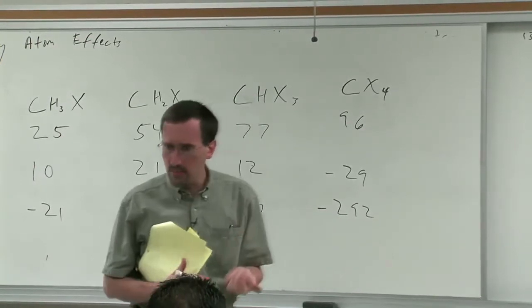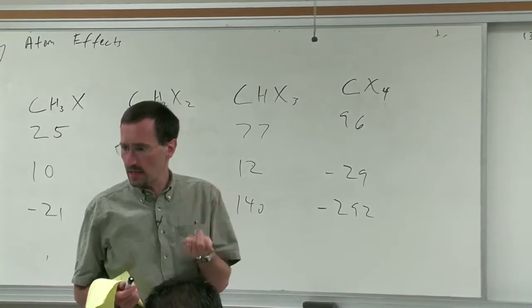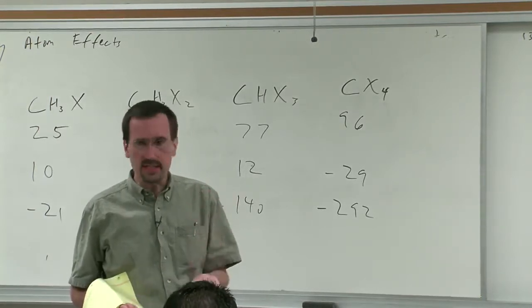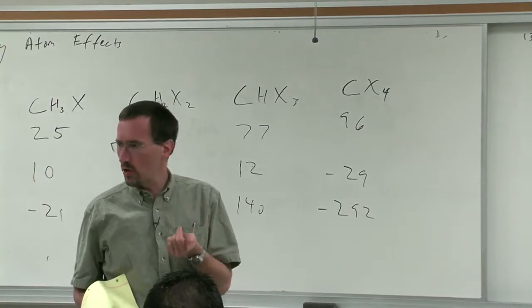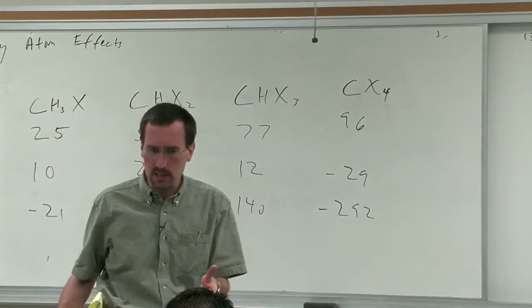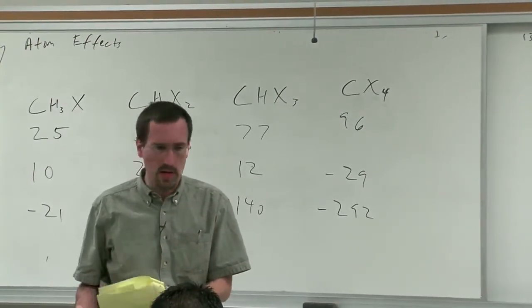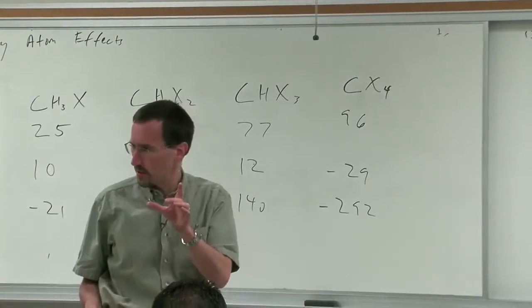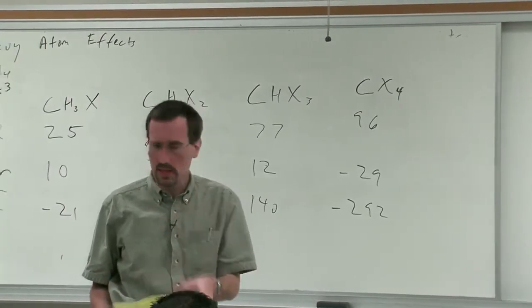If you use ChemDraw and you have one of the more advanced versions of it that does chemical shift prediction, that's exactly what it's doing. Those calculations, also for all sorts of systems, aliphatic and aromatic systems, are shown in your book, in your structure determination, the orange book that you have for the course, the supplemental book.